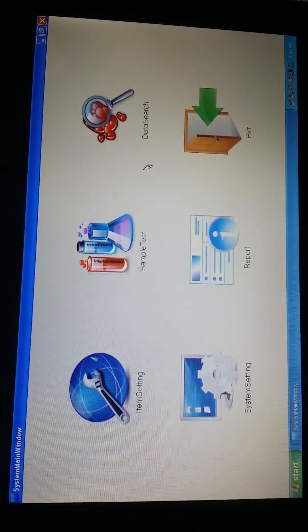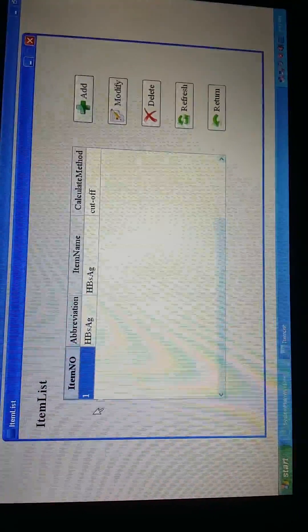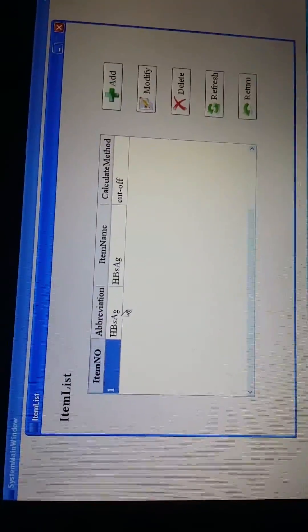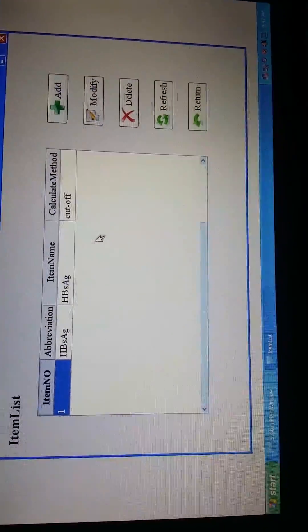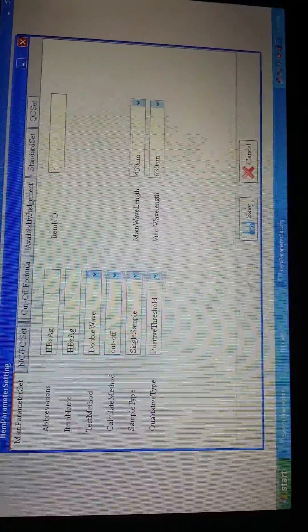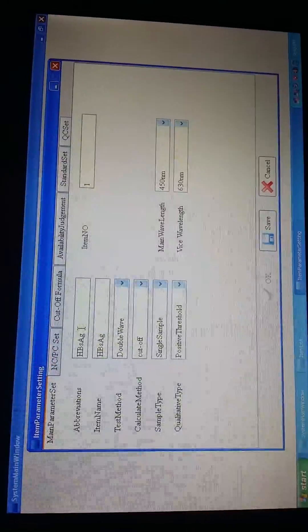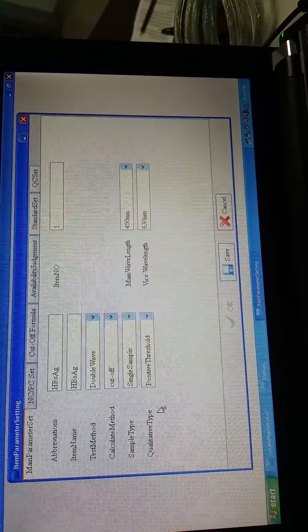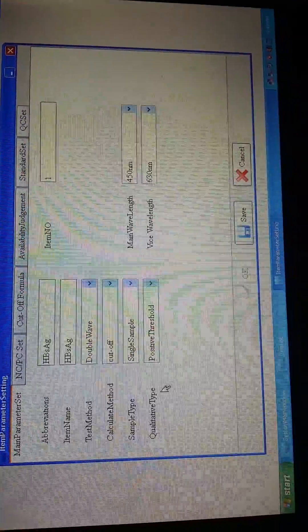Now let me show you how to set up an item. From here we can add or delete items you want to test. For example, this is HBsAg. Let me show you how to modify or delete the parameters. We choose it and press Modify. From here these are the parameter settings — you should put in the name, test measures, calculate measures, sample type, and qualitative type. All parameters should be set according to the reagent specification or reagent user manuals.